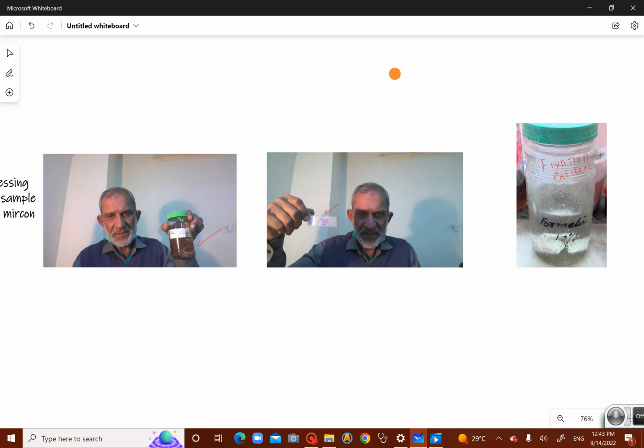Now, what does it involve? These are big chunks of tissues, and these are 2 to 4 micron thick. How do we go from big chunks of tissues to such thin film slides which can be seen under the microscope? That is known as tissue processing, and this involves a number of stages, which we'll discuss one by one.